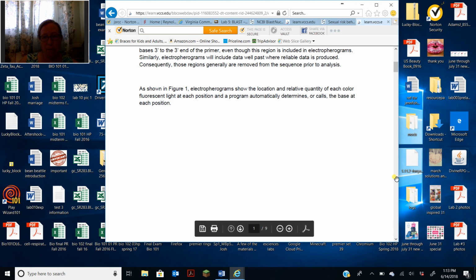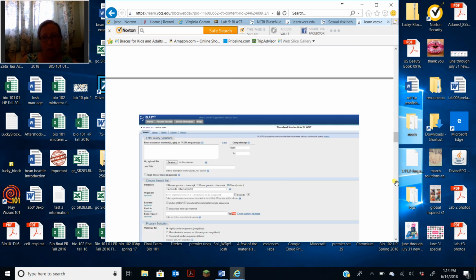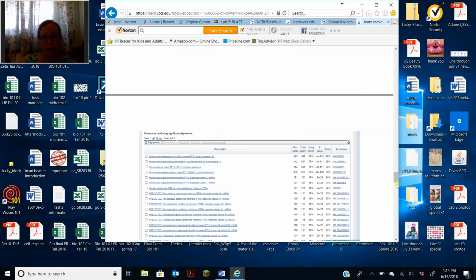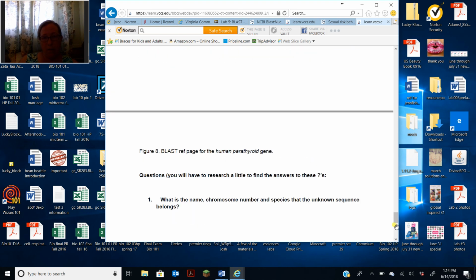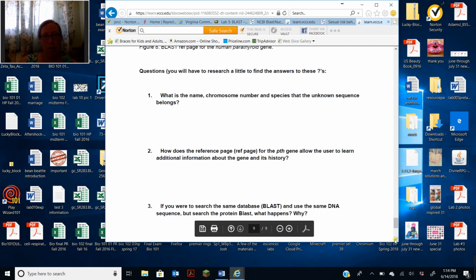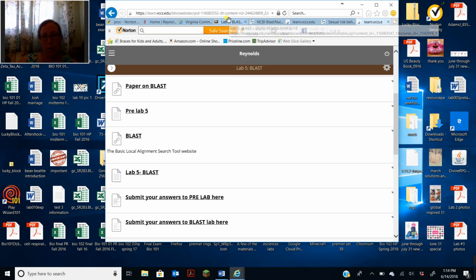Okay, here we go. So basically what I've done is just gone through the lab with you, and that's essentially what you're doing. You're copying and pasting it, you're blasting it. There it is. It's going to give you some information. It's going to show you all the things that I just did. And then there are some questions about it, and you may have to research a little bit to be able to answer these questions completely. So these are the questions that you're going to answer, and then when you're done answering those questions, you're going to plot them right in here.